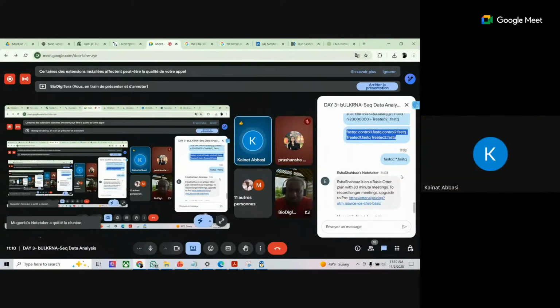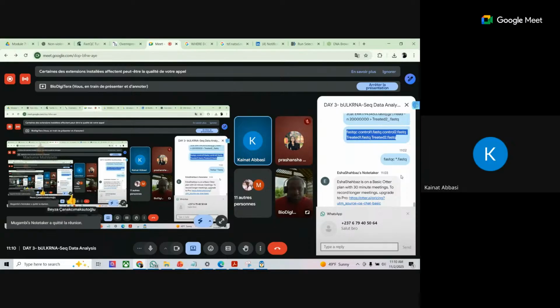I've done it, and it's showing the same files you said. Okay.